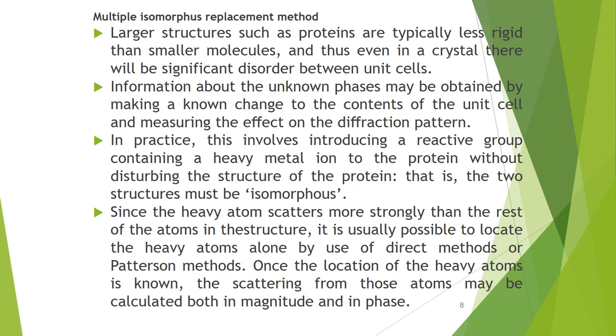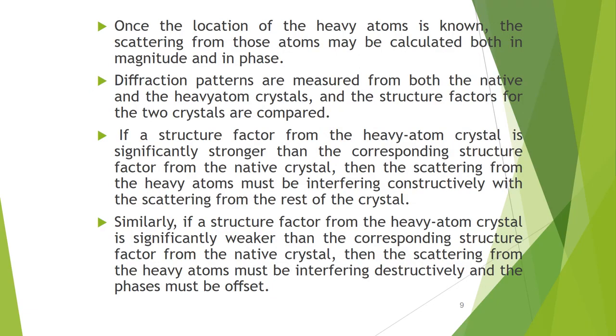It is therefore usually possible to locate the heavy atoms alone by use of direct methods or Patterson methods. Once the location of the heavy atoms is known, the scattering from those atoms may be calculated both in magnitude and in phase.